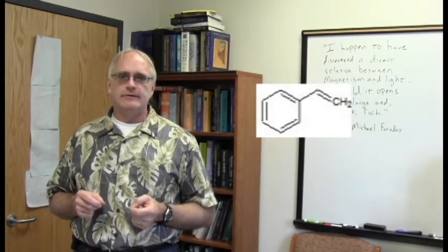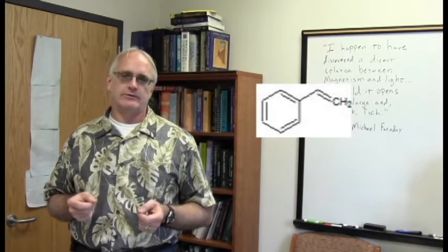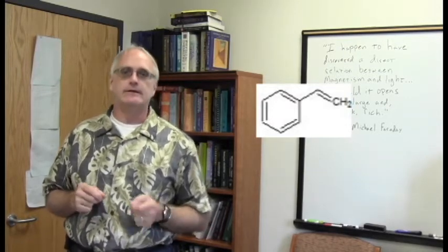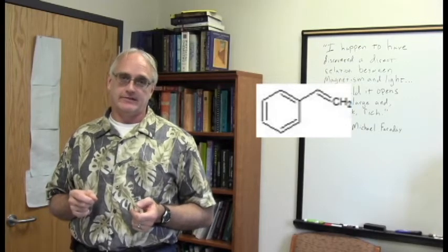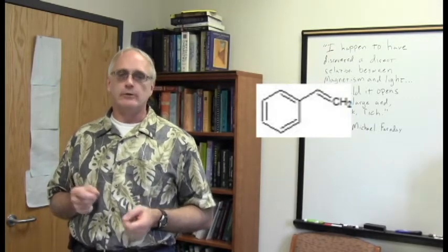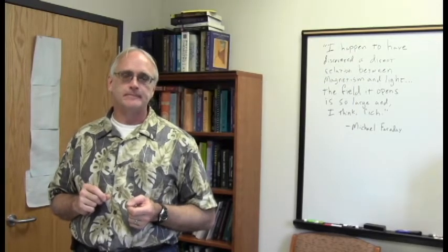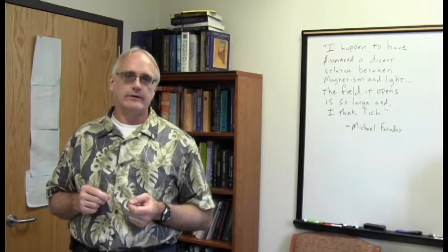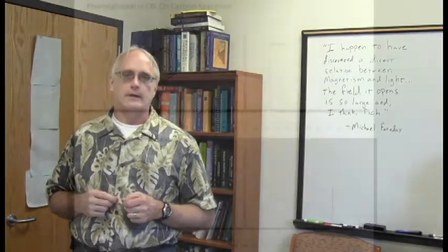And so we made a couple of notes on what we should expect to see in the carbon spectra. Certainly we should see some alkene carbons. And in fact, in a DEPT 135, we should see a CH and a CH2 group if this alkene structure was really what was going on. So we were in deuterated acetonitrile. The concentration was high enough. We did obtain a carbon spectrum, and this is what it looked like.